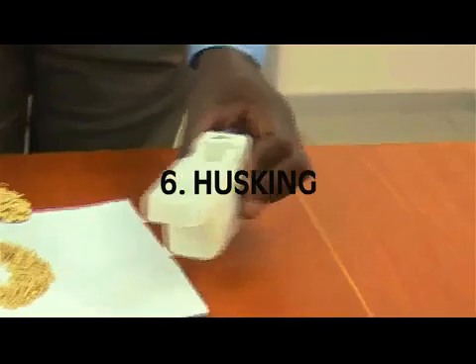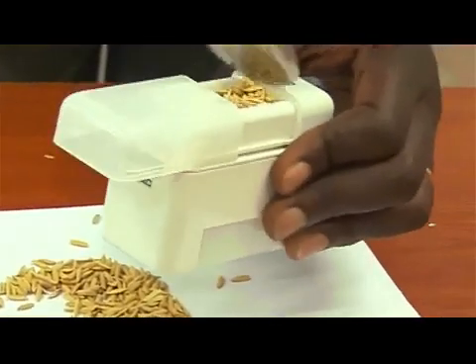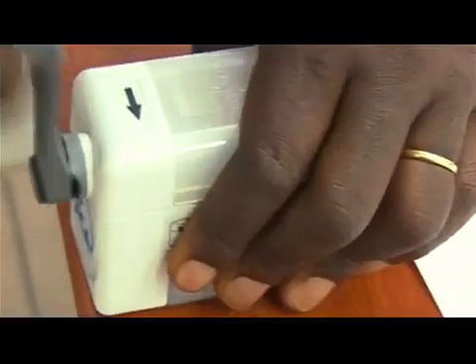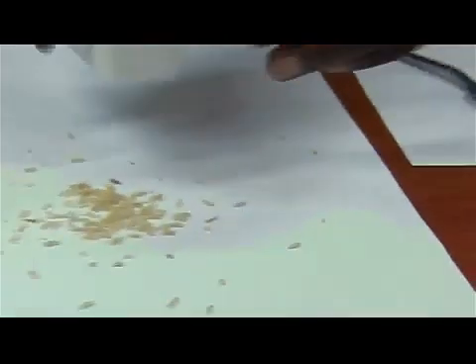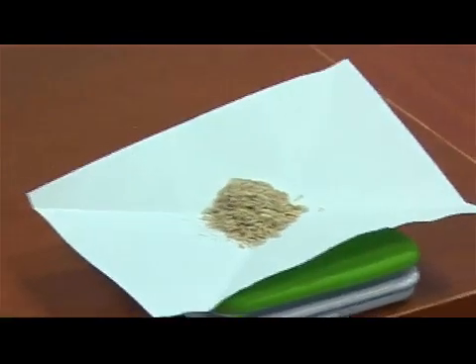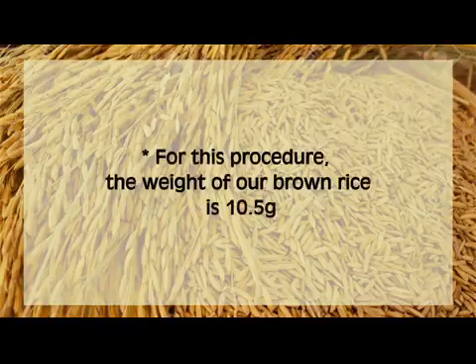Husking. Using the test Huska, remove brown rice from the clean paddy sample. Fill the Huska with paddy and turn the lever in the direction of the arrow. Gently shake the Huska to remove brown rice. Repeat the process until you have exhausted the clean paddy sample. Weigh the resulting brown rice and record your results. For this procedure, the weight of our brown rice is 10.5 grams.